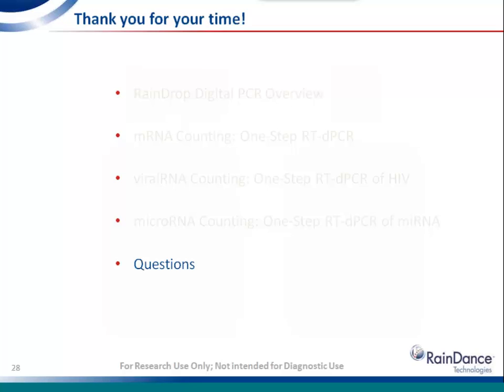Has the system been used to quantify genomic DNA from plasmid preps or to quantitate plasmids directly from preps? That's a great question. So certainly any DNA that you pipette into the well can be quantified. So we certainly have at RainDance used plasmids as DNA input, and certainly customers have done that as well.